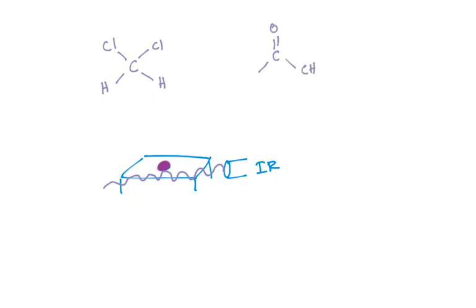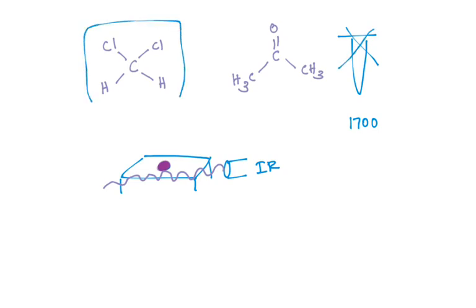This is acetone, right, that we use in our lab as a solvent to wash our glassware. This has a ketone, right? This may give a false peak, false 1700 peak. So don't use acetone, but use a dichloromethane solvent. Okay, that's it.